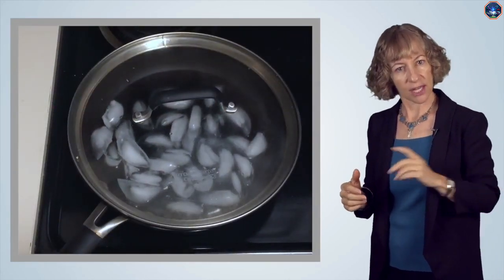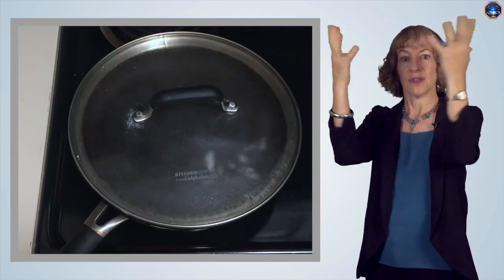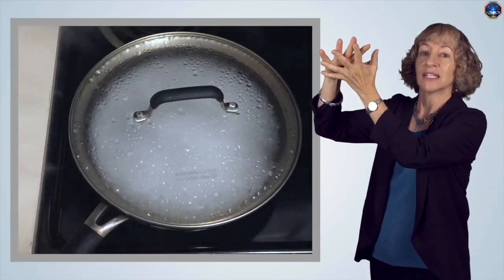Thermal evaporation uses heat to evaporate the ultra-high purity source so that it goes from solid to liquid to gas. The gas atoms travel through the vacuum in the vacuum chamber, and when these atoms hit the substrate, they condense and form a thin film on the surface of the substrate. You can use an everyday example to understand thermal evaporation. In this example, heat is used to melt ice into water, and the water is heated to the point of evaporation. The water vapor, which is now in the gas state, travels toward the surface of the lid, at which point the vapor contacts the cooler surface and condenses.